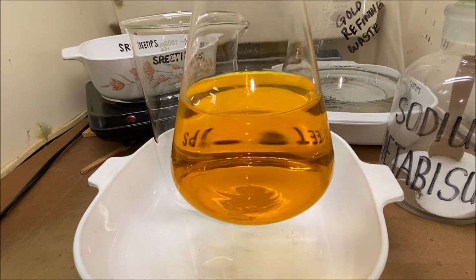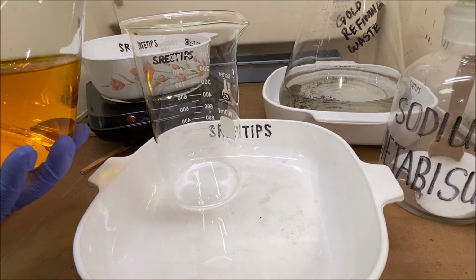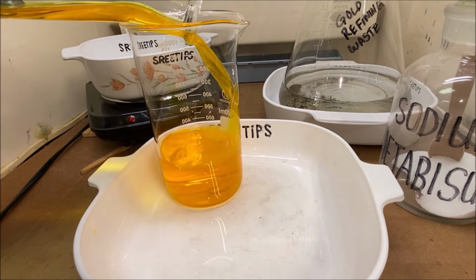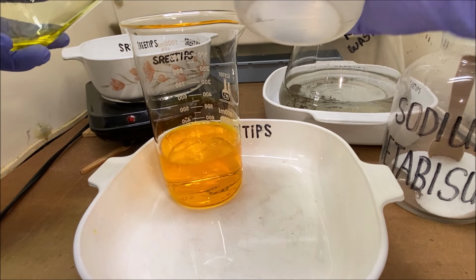Here's our solution. Nice and crystal clear. Every time we dissolve the gold and reprecipitate, it gets cleaner and cleaner every cycle we do that.